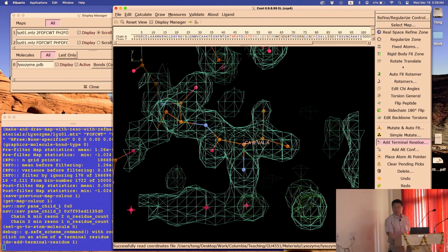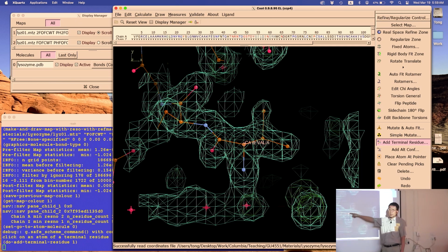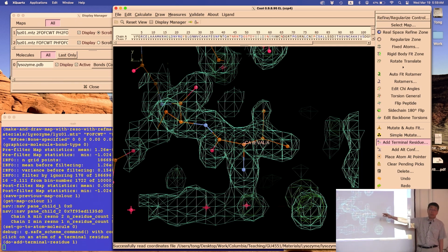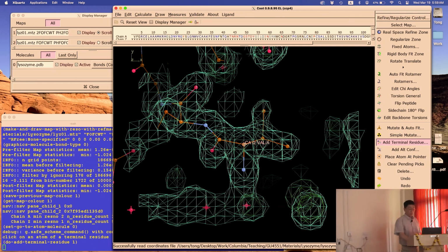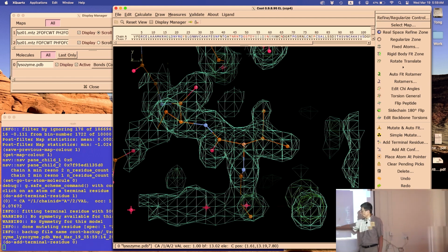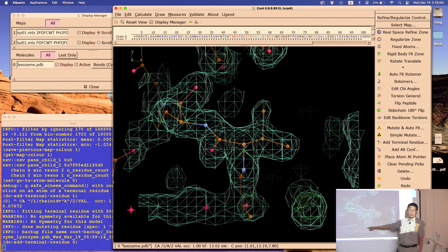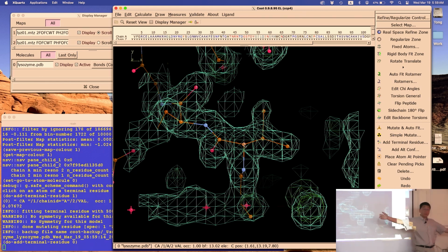And then go in, click any atom of the valine. Click on the atom. Any atom. Okay, so click on it. So I'll click the C alpha. So now you see a residue got built in down here. You see that? You see yours? Everybody good?